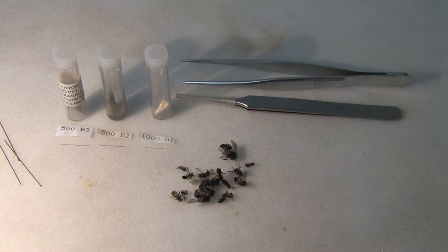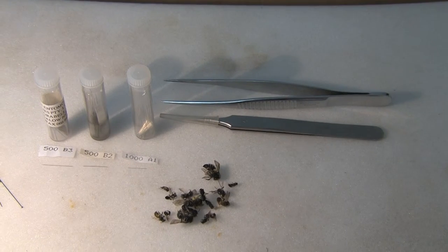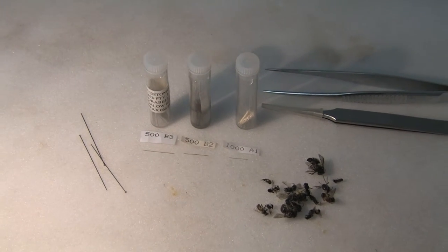Here's the setup I use for pinning the bees. You can see I've got a couple of pairs of forceps — one watchmaker and one just a straight edge. There are some of the bees that we collected during the day, and there are a couple of number two or number three pins on the left.